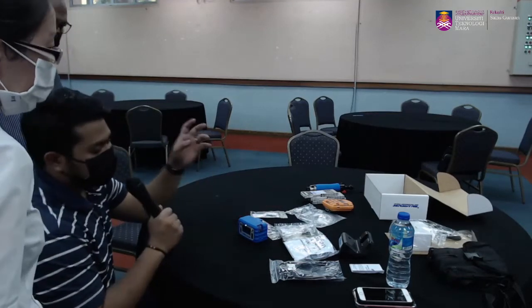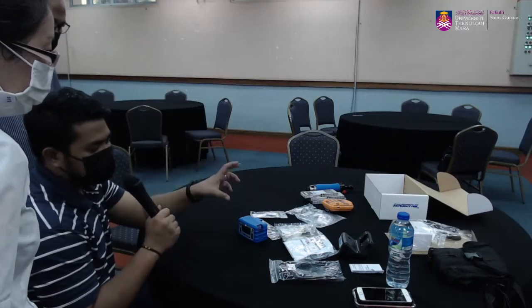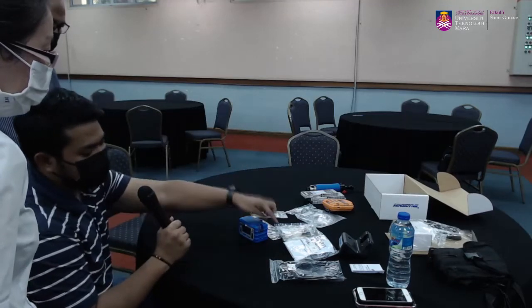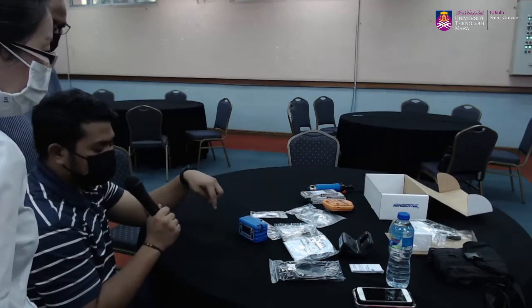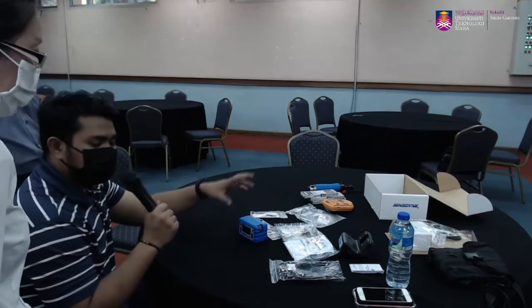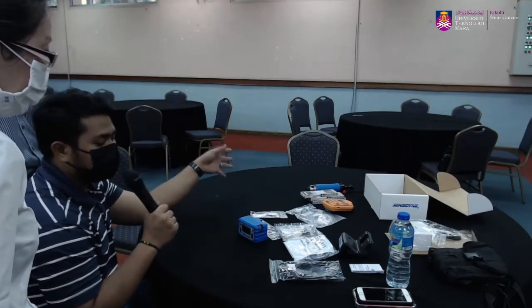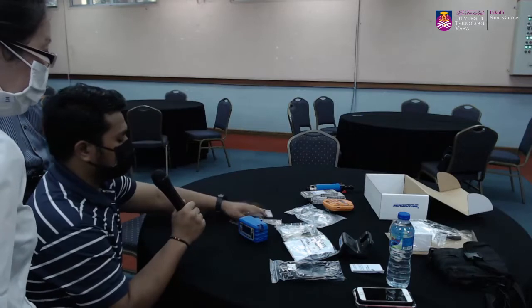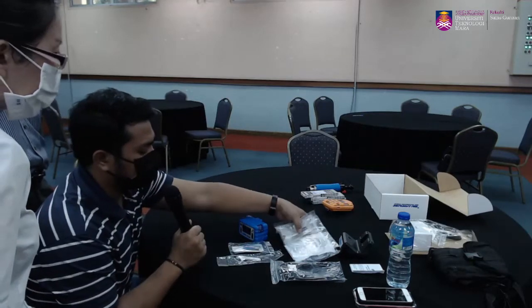In the diagram, it shows the calibration jar connected to the cyclone, the cassette connected to the cyclone, and then you put it in the calibration jar. Then you start calibrating with the airflow calibrator unit. So these are the accessories for sampling.